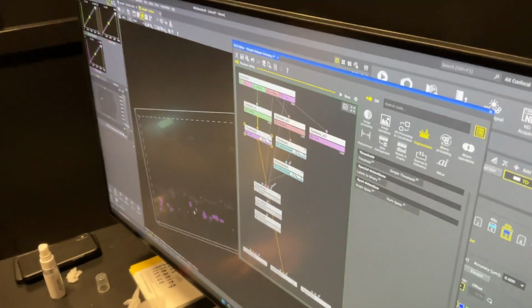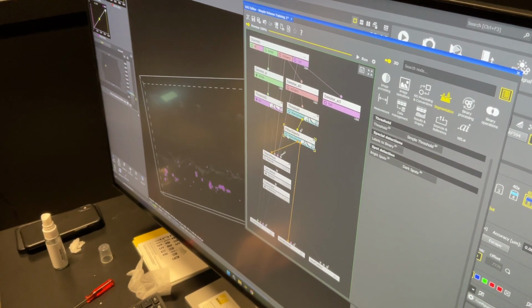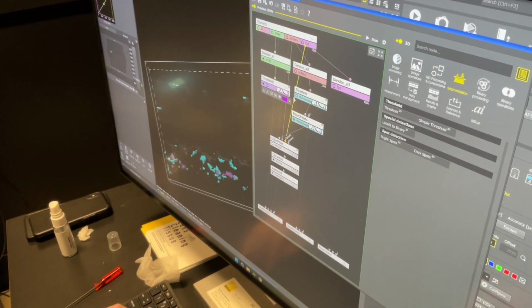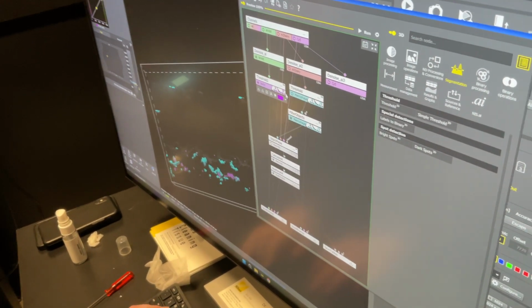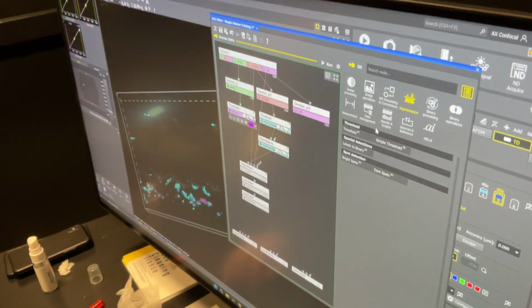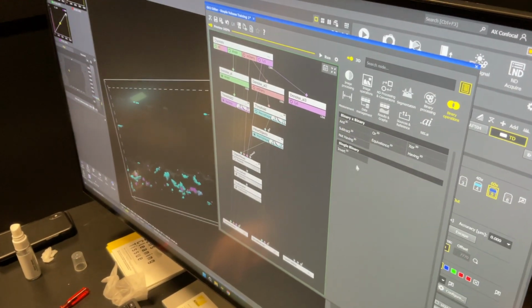So then you want all of the, so what we call these are infected. The green by itself is just the salmonella, but bacteria is either one. So let's call this bacteria. And then, because we want all of the macrophages having bacteria, I'm going to go to my binary operations.